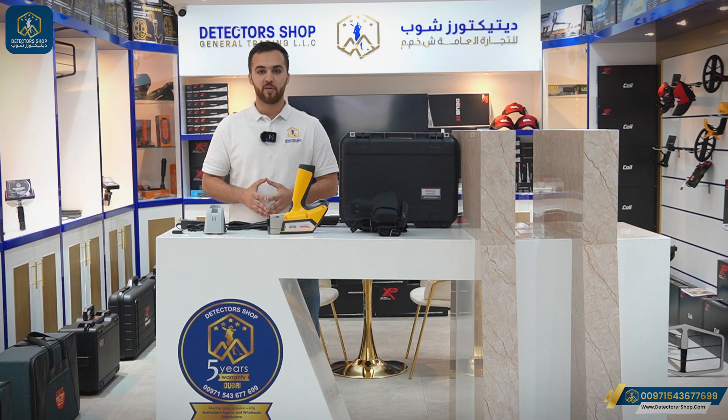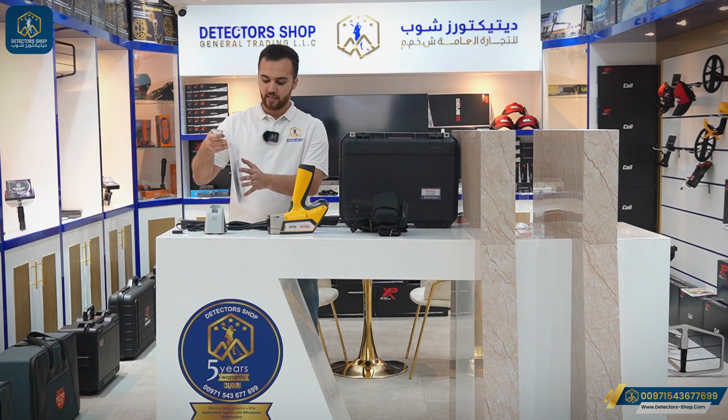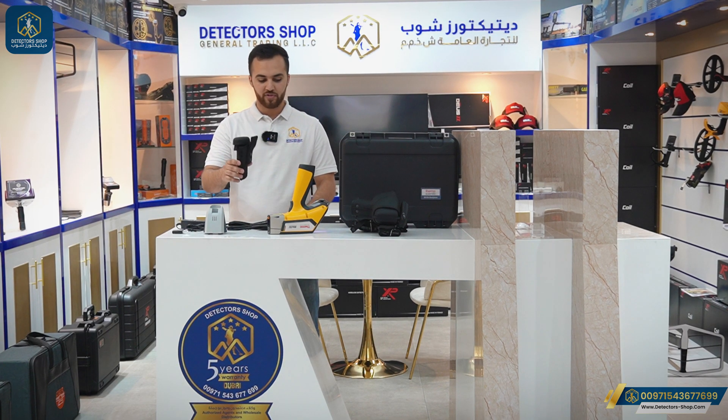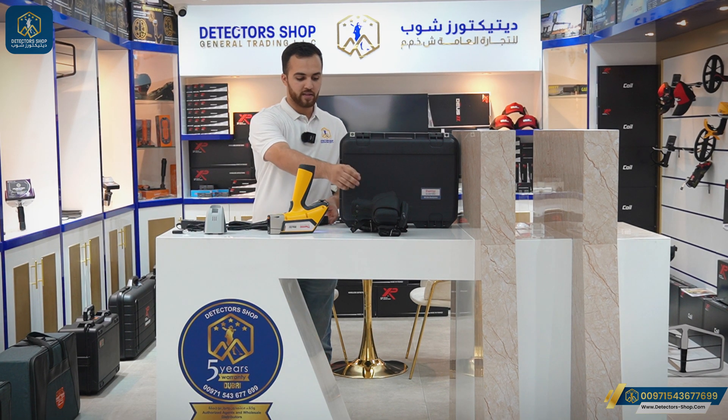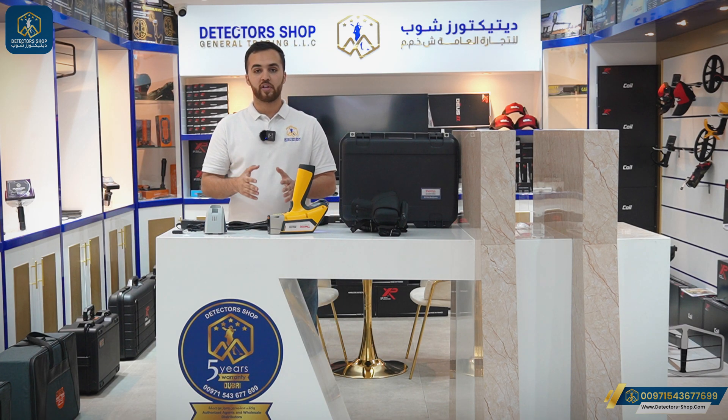These are all the accessories of the device, starting with the charging accessories plus the charger for the battery. Here we have the manual plus the cable to transfer data to PC. We also have the battery case and the device case, plus the main unit.